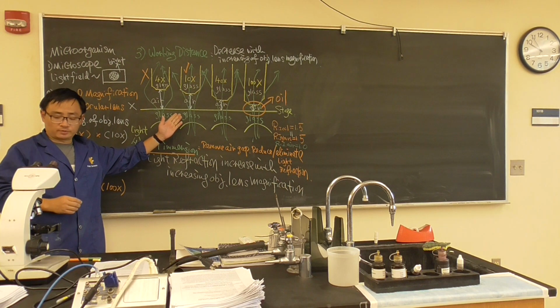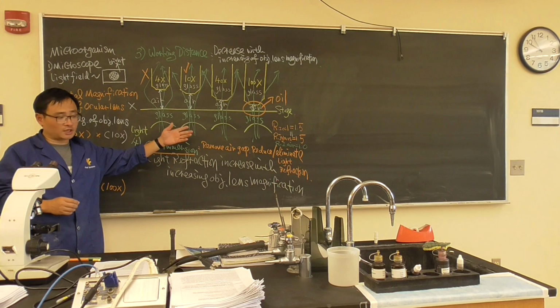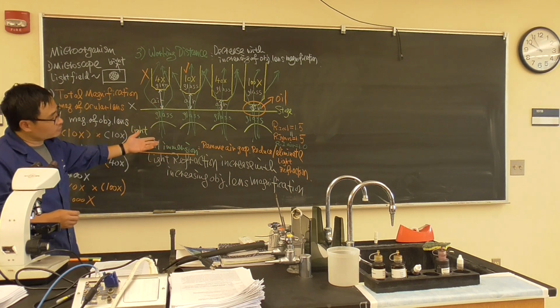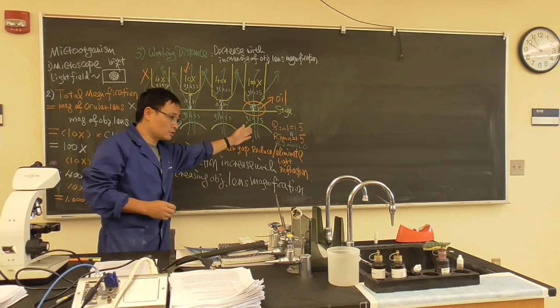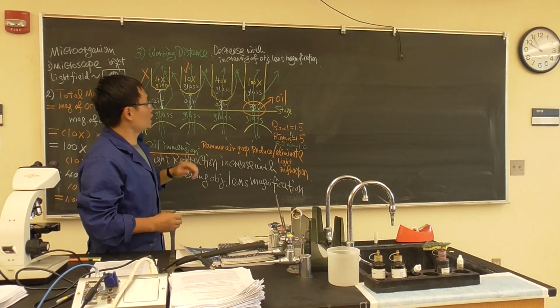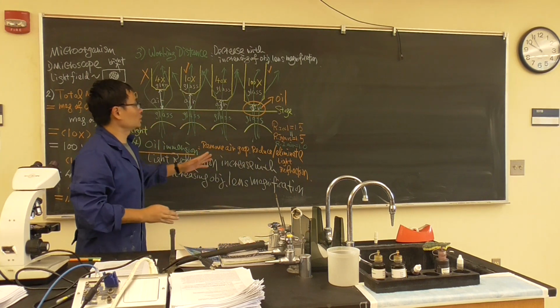But when you do the observation, you will not see any of the detail, including the morphology, the shape, the color, and arrangement. You're not going to see it in detail. So we're going to add 1 drop of the oil, switch to 100x to do the observation.